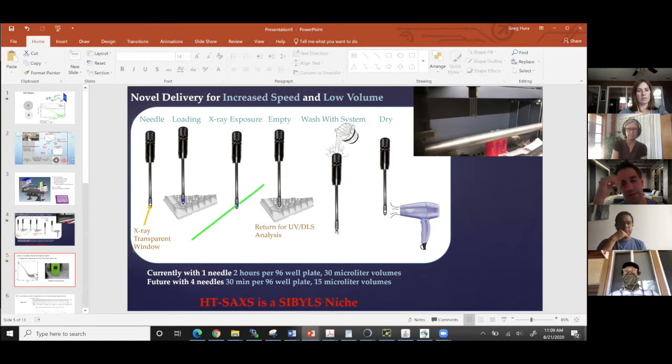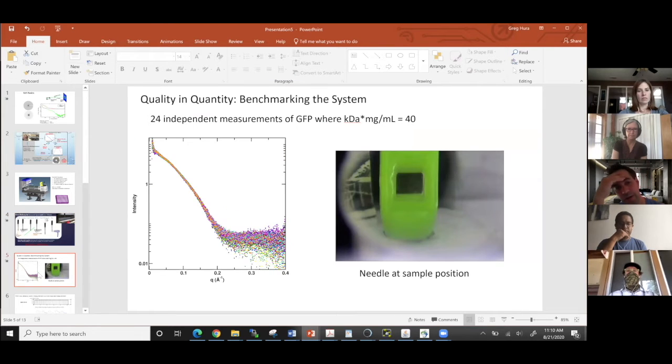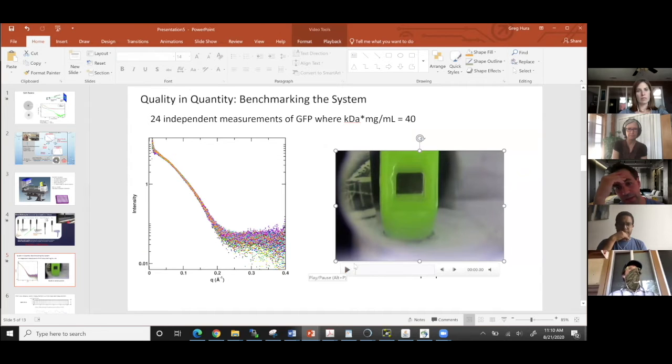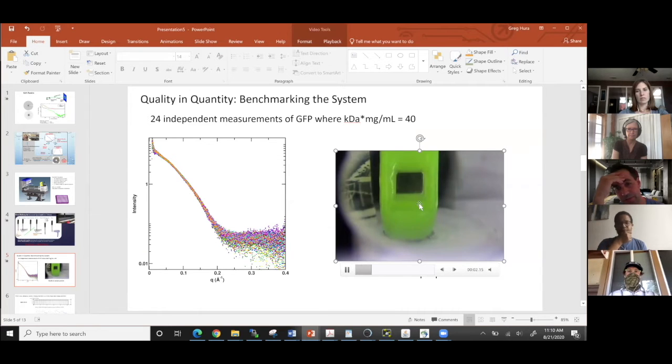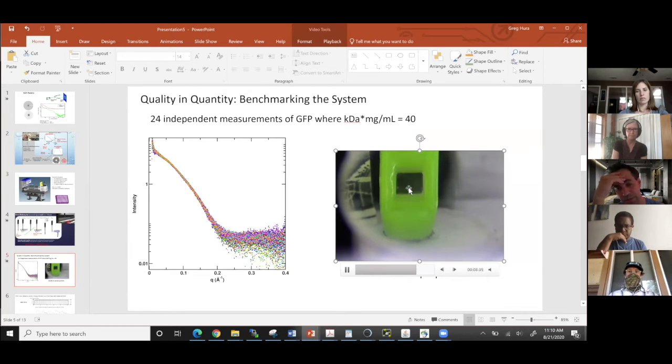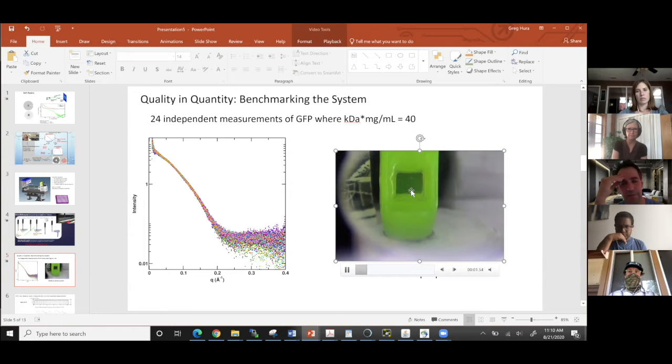As part of the package, you'll get images of your sample. So this is several loads of GFP being brought into the needle. This is the needle landing in front of the X-ray beam. The X-ray beam is going straight into the sample cell. So you get pictures like this.